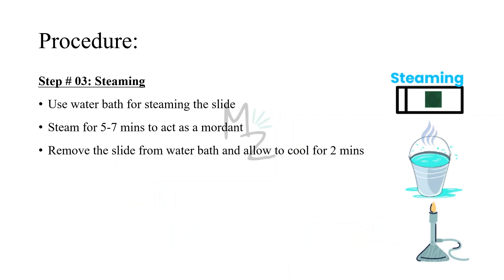Step three is steaming. As the slide is placed on the water bath, we'll turn on the burner and heat the water bath to steam the slide for five to seven minutes — this steam acts as a mordant, enhancing the binding of the dye or stain. Then we'll remove the slide from the water bath with forceps, since the slide is hot, and allow it to cool for two minutes.